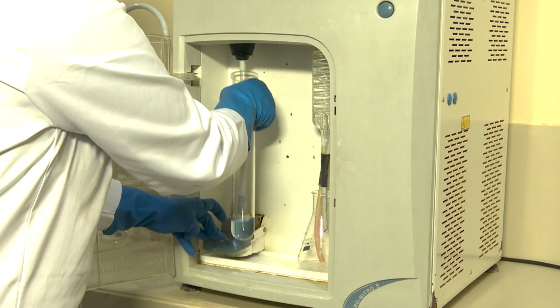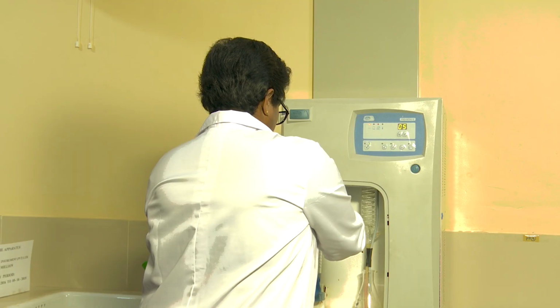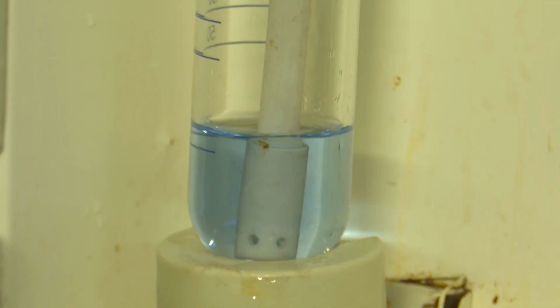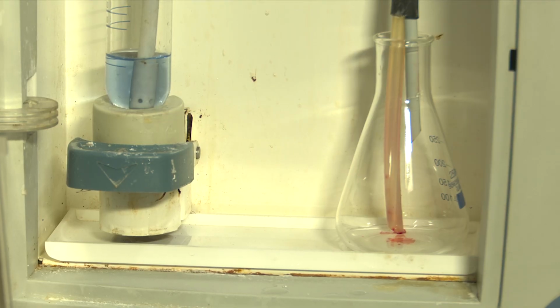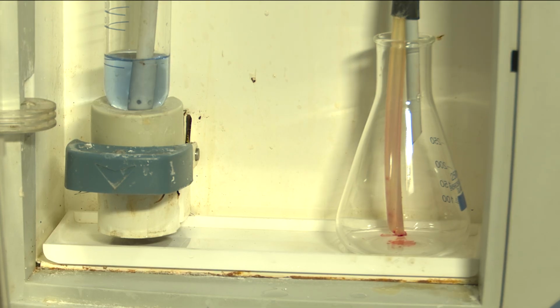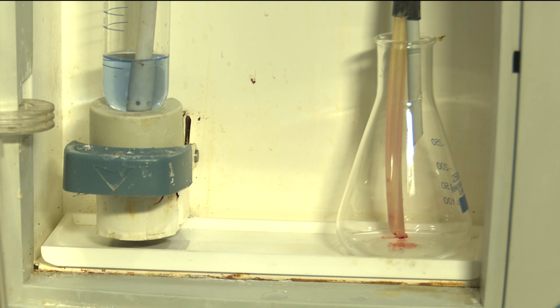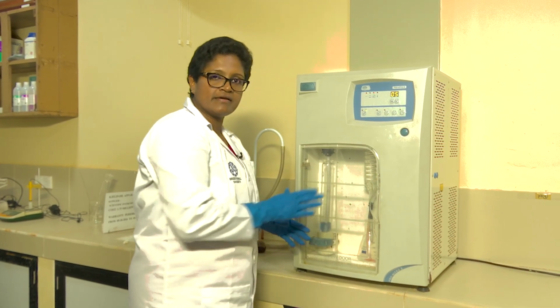After the complete digestion process, you can observe a clear solution in which all the nitrogen in the sample has been converted into ammonium sulfate. The slight blue color can be observed in the digested sample due to the presence of copper sulfate as one of the components in the Kjeldahl catalyst tablets added during the digestion step. And now you are about to start the distillation process.